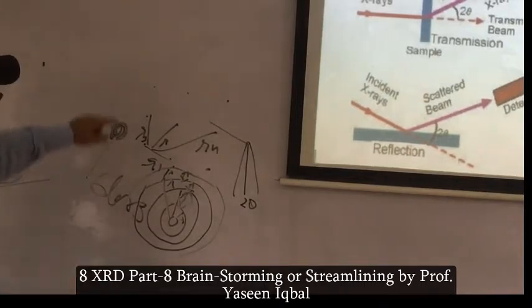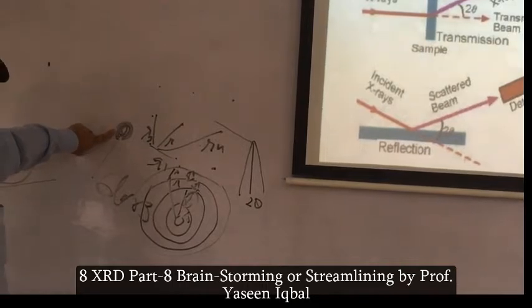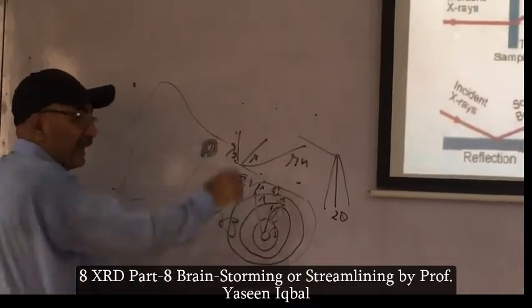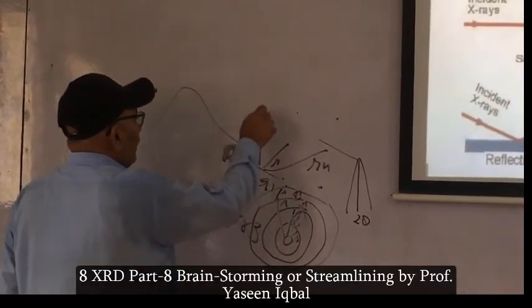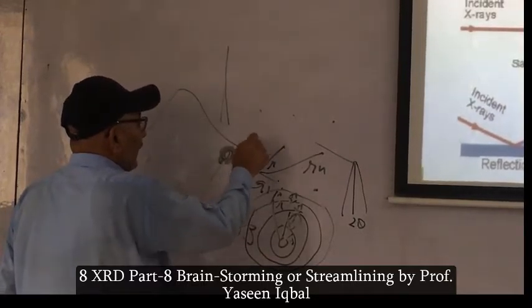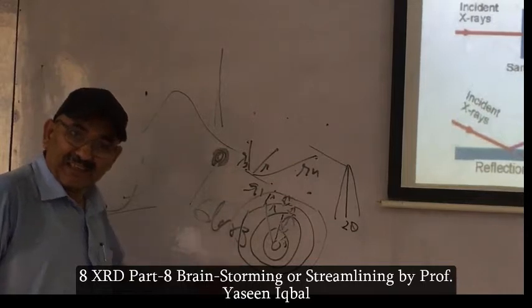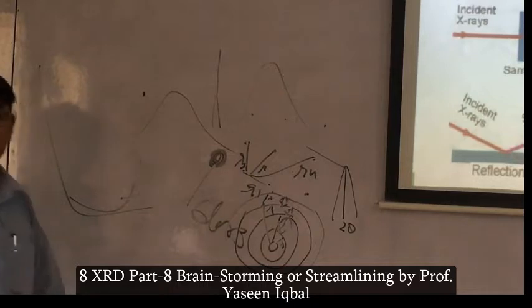Now, this diffraction pattern, look at the geometry and symmetry. This is a diffuse ring, and in XRD, you have an amorphous hump, right? Here, for large crystals, you have sharp peaks and you have spots in the electron diffraction pattern. Here, you have rings in the electron diffraction pattern, and in the X-ray, you have broader peaks.